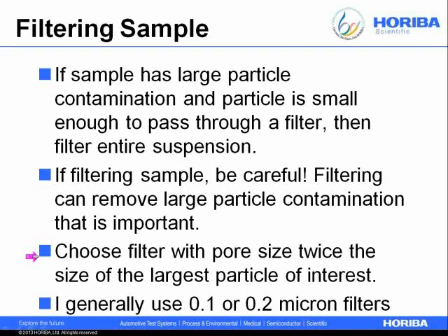Sometimes you can filter a sample through a 0.1 micron filter, look at the result, then filter through a 0.2 micron filter and look at the result. If your result is exactly the filter size, or if the filters are becoming plugged, then you'll know that your filtration is strongly affecting the sample.